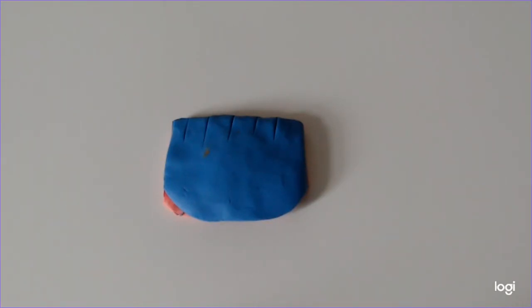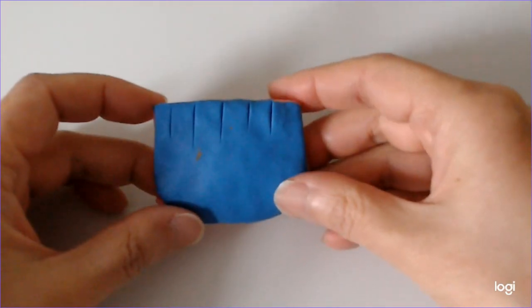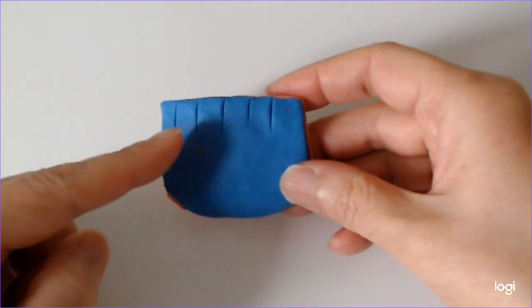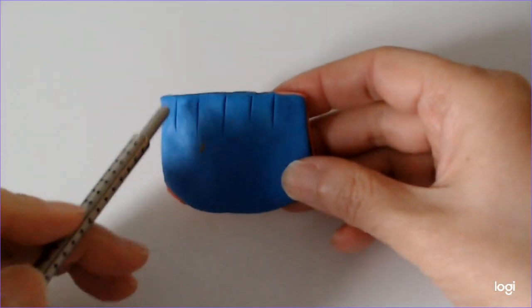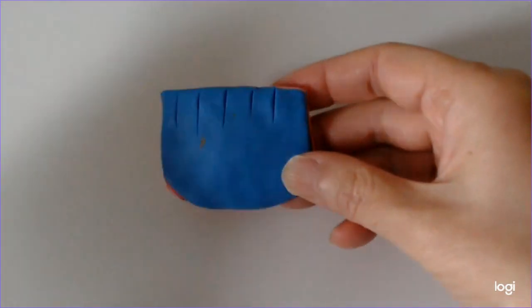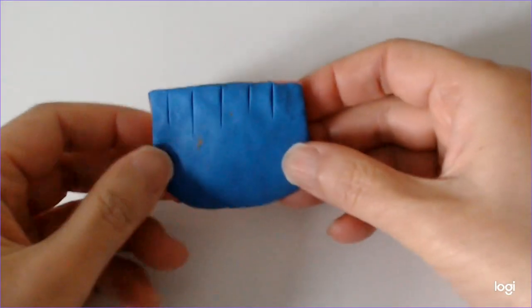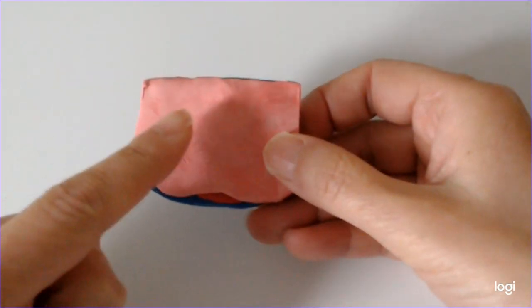We've previously looked at skin specimens and how to sample them so we can assess margins. The anatomy gets more interesting when we deal with a full thickness eyelid. As before, the skin surface is blue. At the free margin, we have these schematic eyelashes. The skin is continuous with the conjunctival surface, which I've made pink.